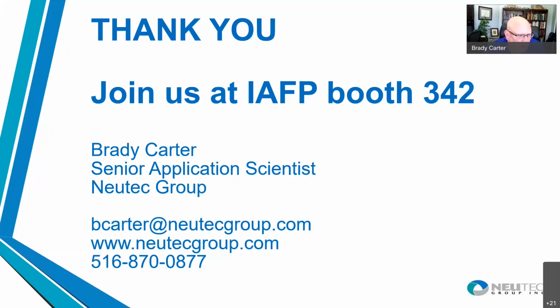There is probably some advantage to implementing some sort of screening tests for incoming ingredients. Like we said, imaging is one way to detect adulterants. Water activity testing of incoming ingredients is another fairly simple way to track that consistency. If the water activity is suddenly changed, there probably are other changes that have occurred, and it may not be a batch of ingredients that you want to accept from the producer.